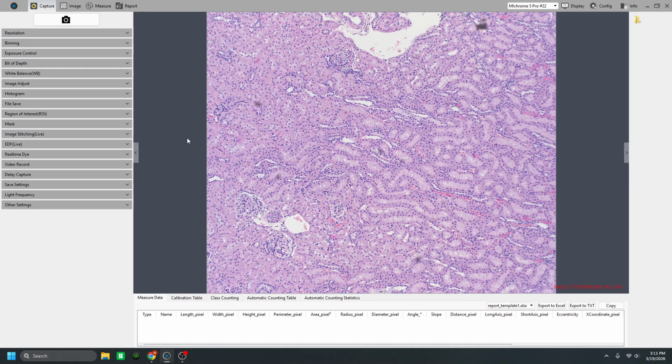Essentially, this software is a very similar configuration and setup to the 3.1 software. The main differences are just the layout of the icons, and some of the deeper functions are more simplified and consolidated. But other than that, that's just a basic preview of the software and kind of lets you know how you can use everything.